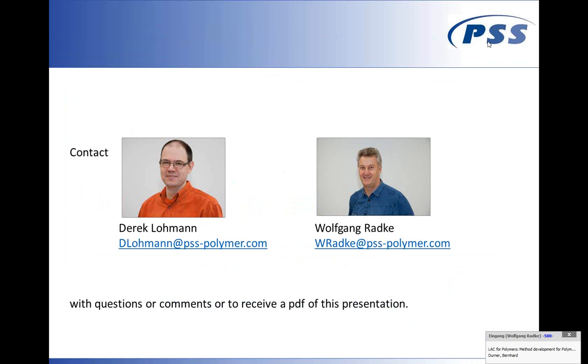Yes, it depends on what you would like to do. First of all, what is known is the smaller the pore size, the more difficult it is to establish critical conditions. So that would mean I would like to use larger pore sizes, then I don't run into so much trouble.